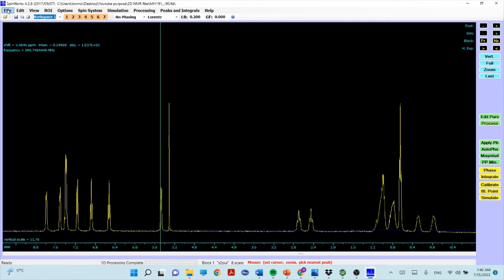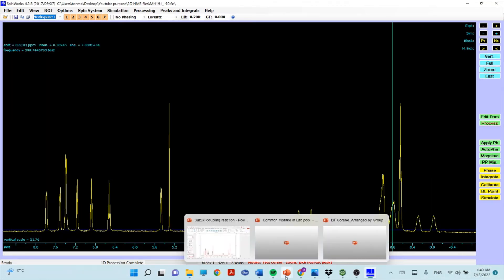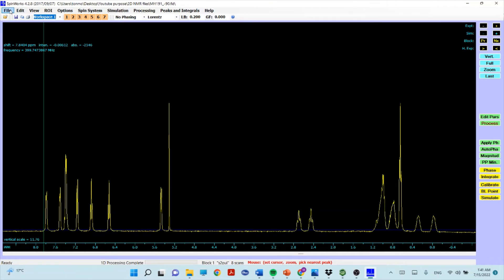Now let's go back to process the COSY NMR. COSY is one of the 2D NMR techniques — it shows the relationship between proton-proton coupling, specifically protons that are three bonds away from each other. COSY stands for Correlated Spectroscopy, showing which proton is next to another proton.